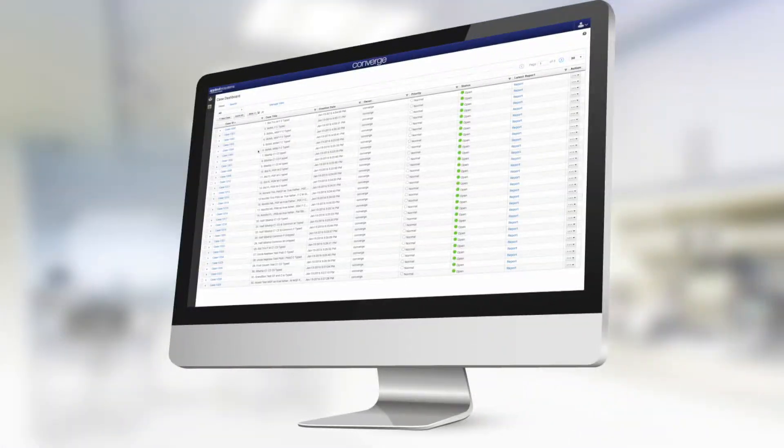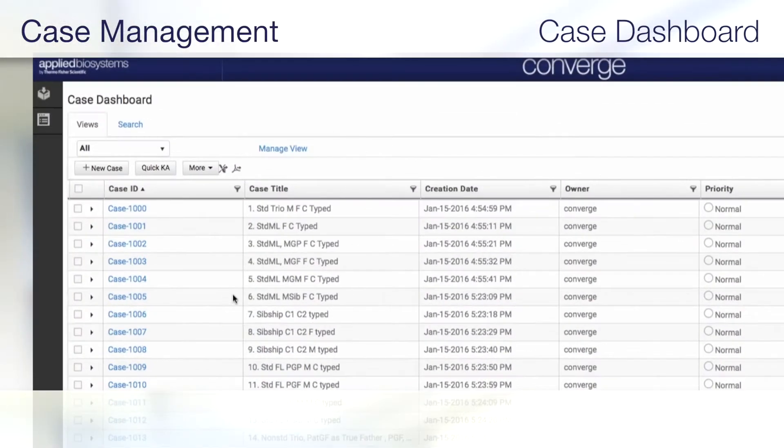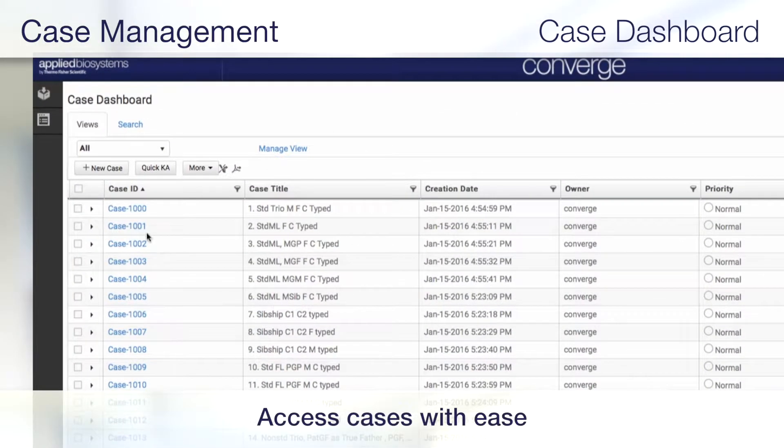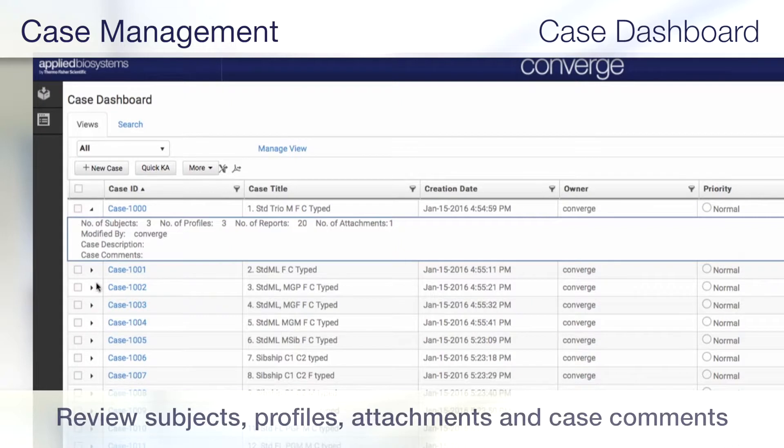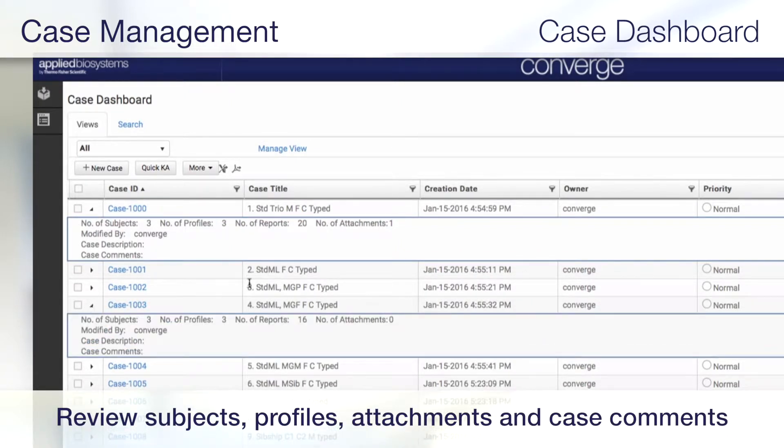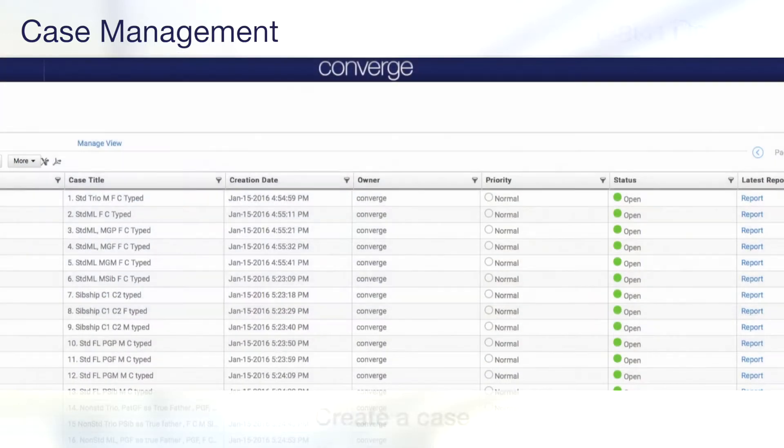With the Case Dashboard, you can review case status and access case reports with ease, see the number of subjects, profiles, and attachments, as well as case comments and descriptions for an at-a-glance overview of any case.